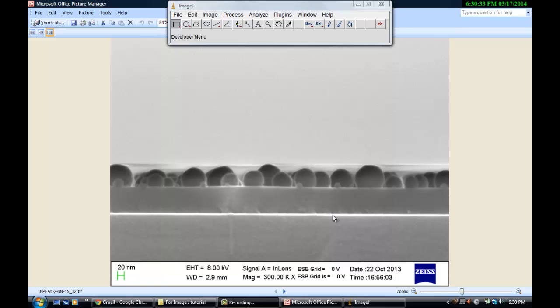So first of all, let's say I want to know the thickness of the dielectric which has been deposited on the silicon substrate.